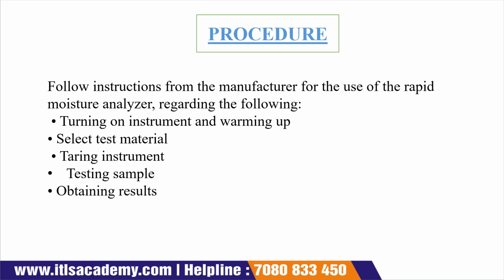Now the next one is the procedure. In the procedure, what should we have to do?